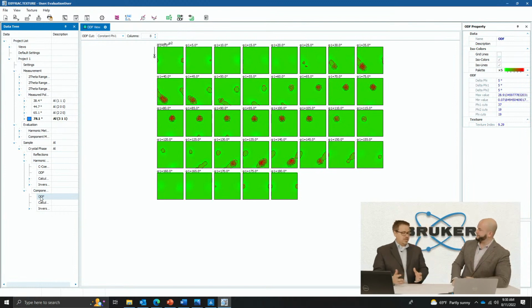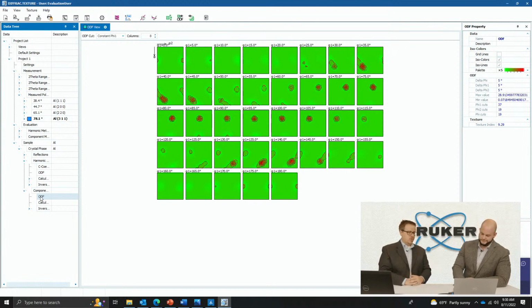Yeah, so the big difference there is that this is more quantitative, and we're actually fitting and regressing this model of a certain number of components, and that's why the background is much better. One other thing to note, though, we did talk about spheres, and we talked about fibers, and even ellipses a little bit, and that's actually where the name comes from. The name actually comes from the ODF. If we were to look at this in 3D space, a spherical component actually looks like a sphere. And a fiber component will look like a fiber. So that's where the names actually come from.